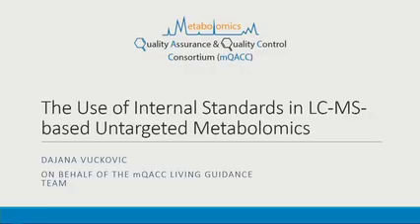Hello. I would like to raise an interesting question here. What was mentioned is that when we are creating a pooled QC sample, there is an option either to create it from the sample itself, so pre-extraction, or to create the pooled QC from the sample prepared for injection, so post-extraction and post-processing.